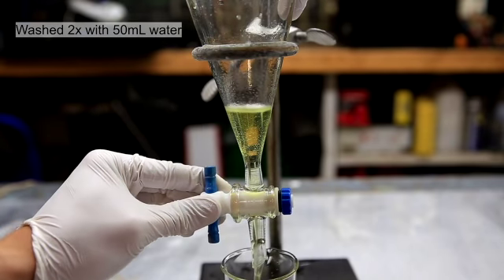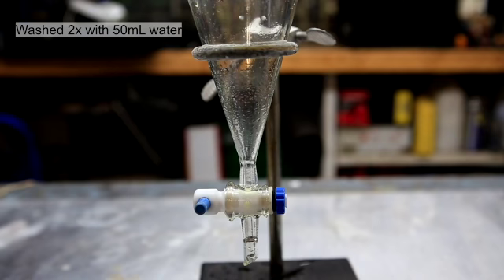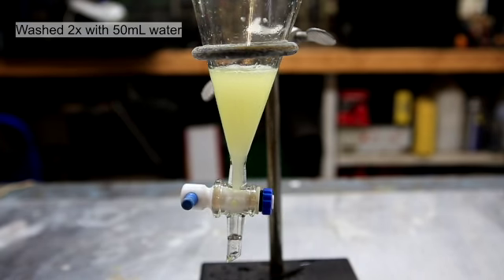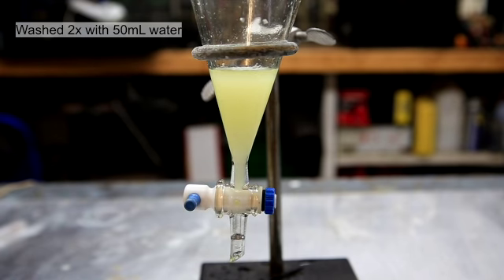The nitrobenzene is slightly soluble in water, so the water does become a faint yellow color. Because there are trace amounts of the nitrobenzene in the water, it's important that the water is disposed of correctly because nitrobenzene is actually quite toxic.